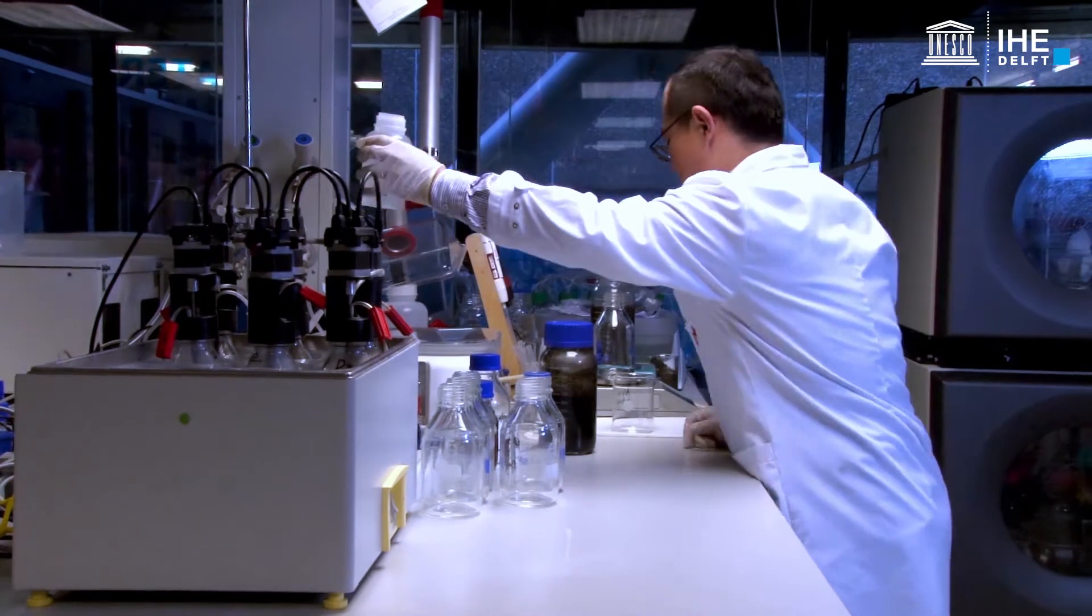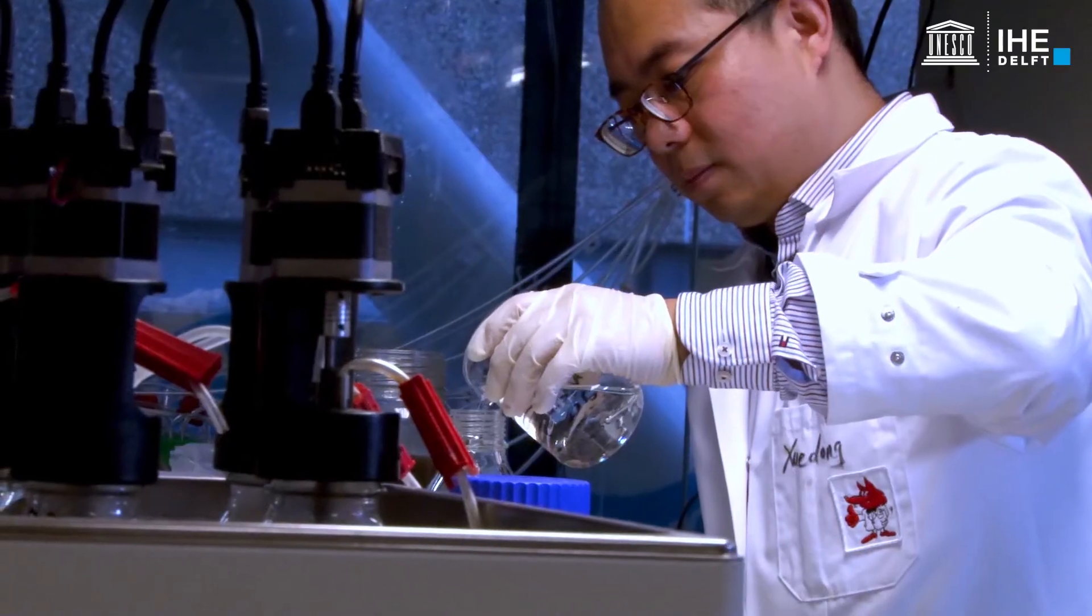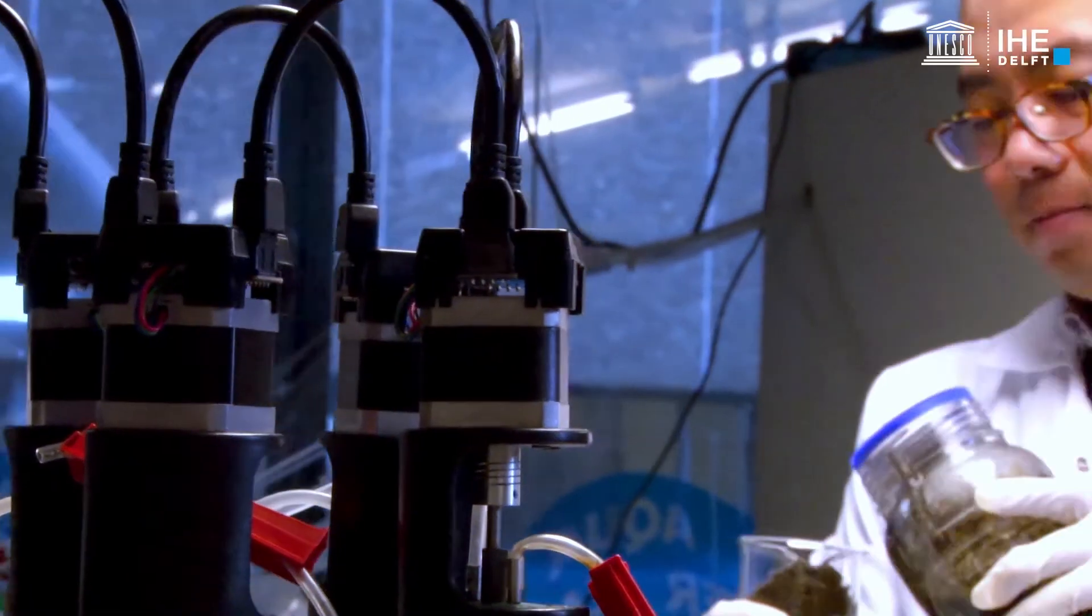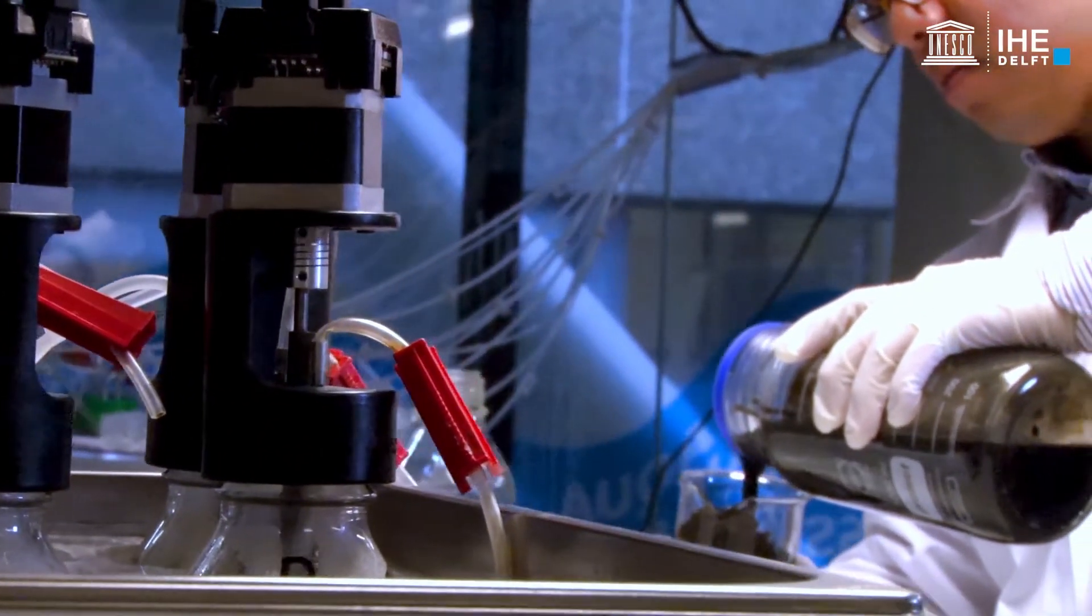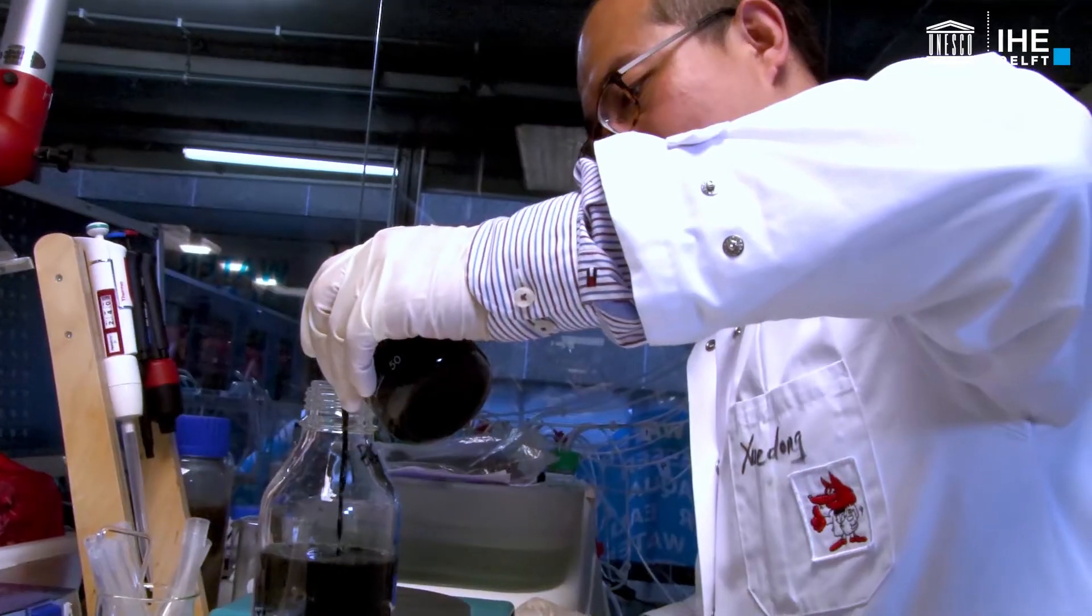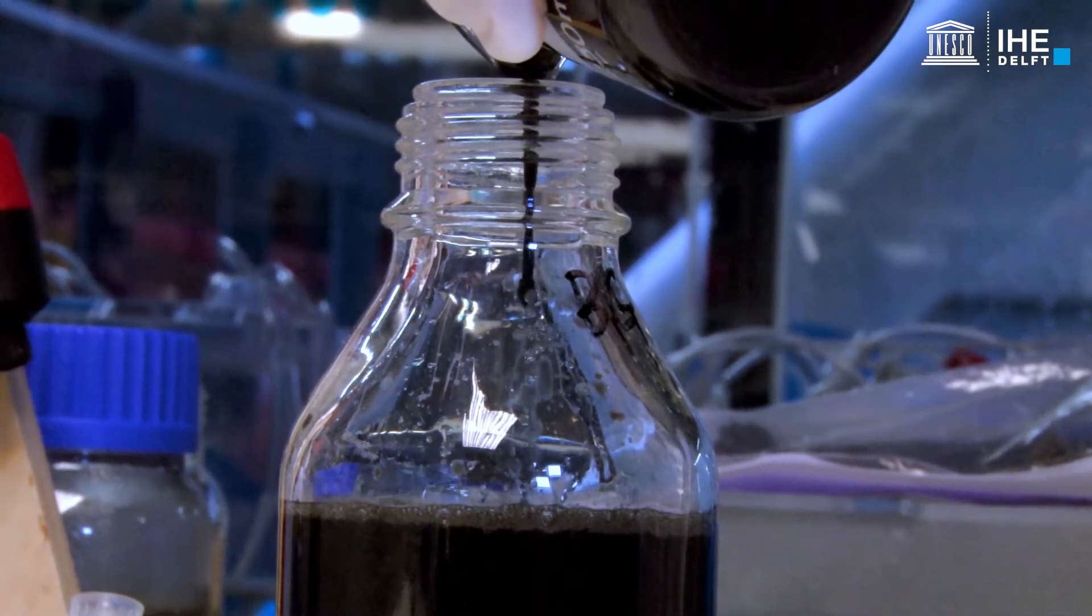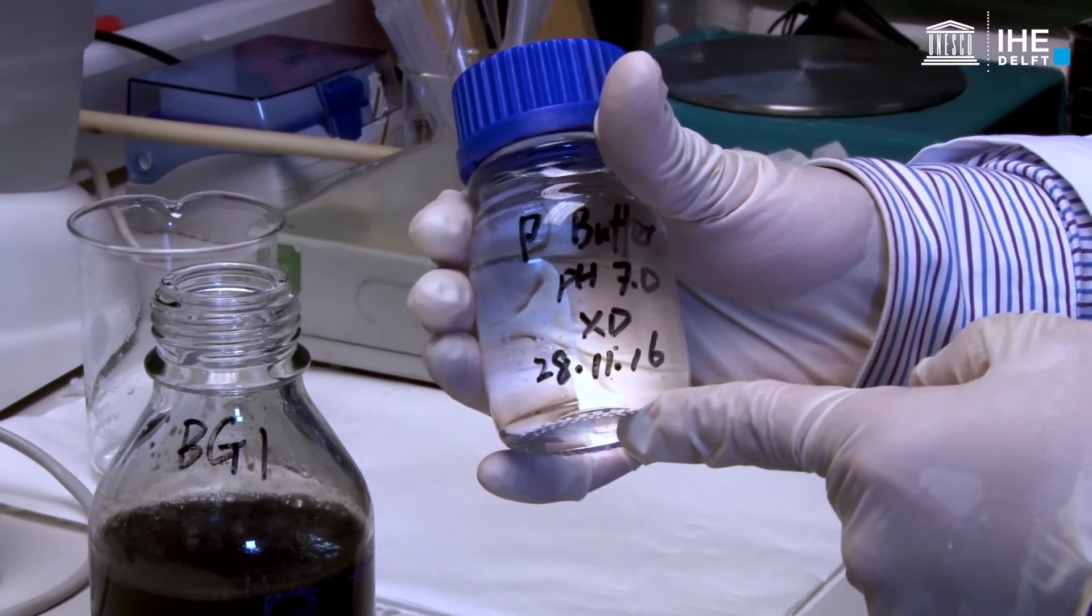For the blanks, using a balance, first weigh and fill up the bottle with the volume of inoculum estimated. Use a pipette to add the phosphorus buffer solution.